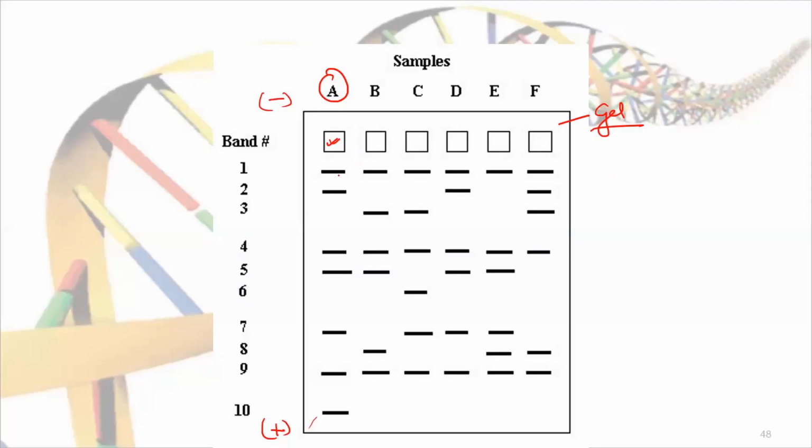Now when the DNA molecules move, these bands which you can see are called the DNA bands. Okay. As of now, just understand that these are the positions where certain DNA fragments get settled. What bands are and how they are formed, I'll tell you later.